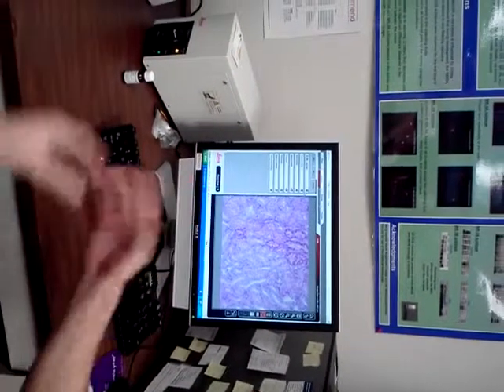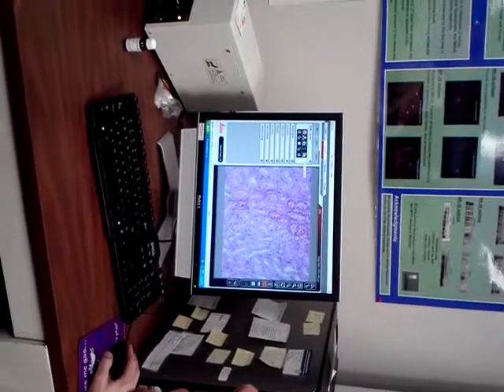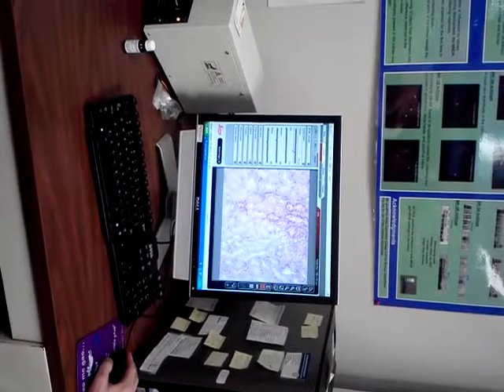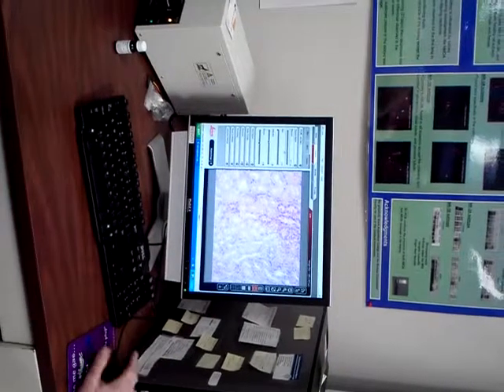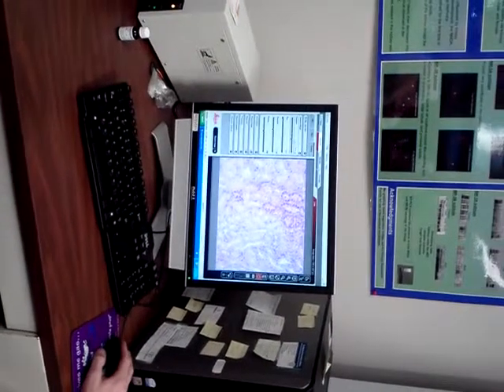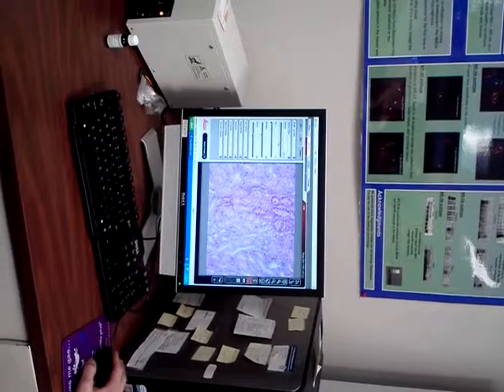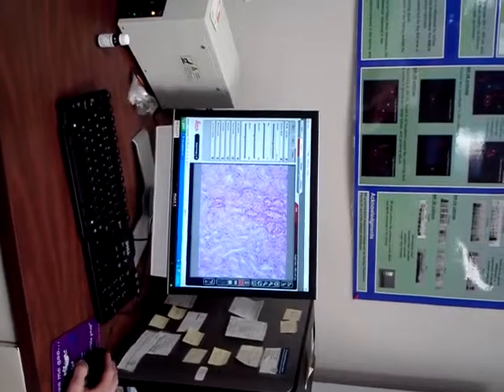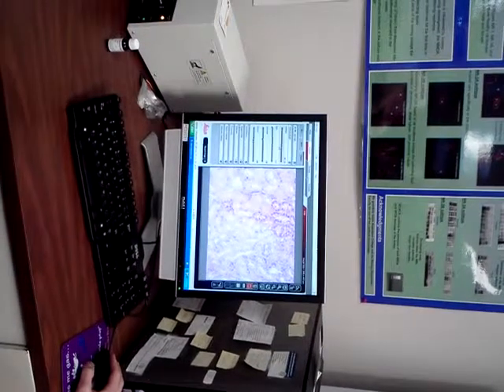It's not going to blow up or anything. It's just if you end up increasing your exposure times, like I was talking to you about, it's going to get really hot. This camera isn't cooled, so you could get some of those dead pixels. Does it damage the camera? Yep. Okay, well, we don't want to do that. Right. You know, I have a Cool Snap. That's a good camera too. Better than this? Cool Snap EZ. Is that what it is? Mm-hmm. That's on the other scope. Okay. That'd be an option too.